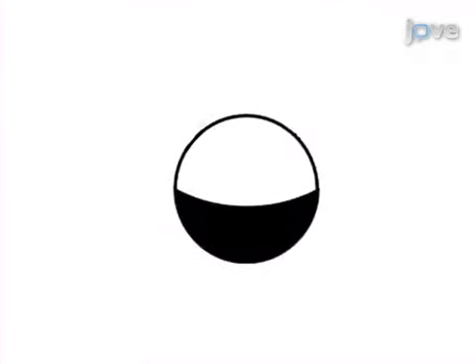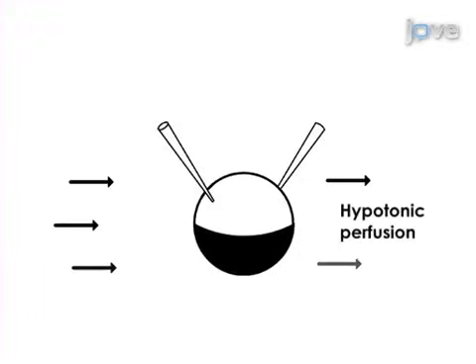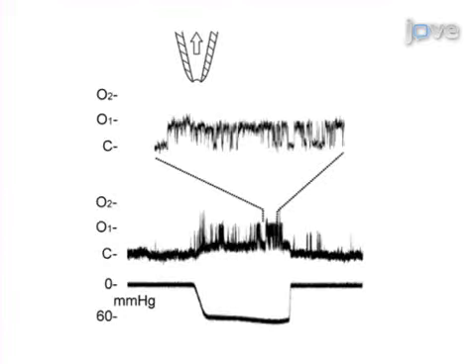This can also be examined with the electrophysiological approach. TRPV4 cRNA is first generated and injected into Xenopus oocytes. After incubation, oocytes are examined by two-electrode voltage clamp upon the hypotonic challenge. To examine the mechanosensitivity at the single-channel level, suction is applied to the membrane patches excised from the oocytes.